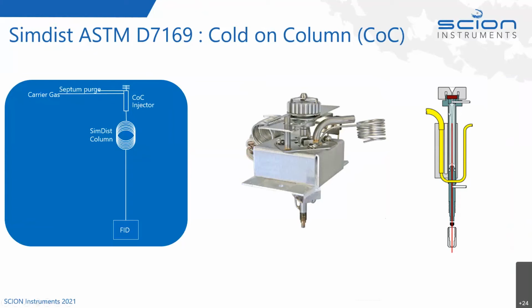The glass liner that you see is really a needle guide for the Autosampler syringe needle to go in, and that just guides it onto the top of the column itself. So it's an on-column injector. There's no split, so 100% of the sample will go onto the column. We're injecting quite small amounts, so we can take an ordinary Autosampler syringe. It can be all automated, and it will do the on-column injection for you. And you're talking about maybe only injecting 0.2 of a microliter from the 2 ml sample vial.